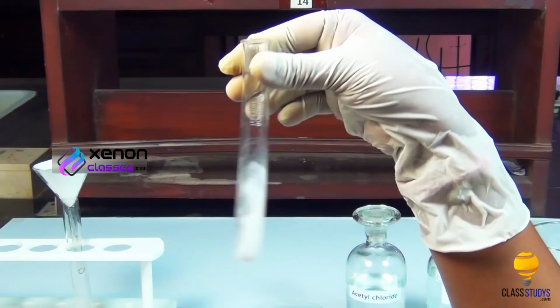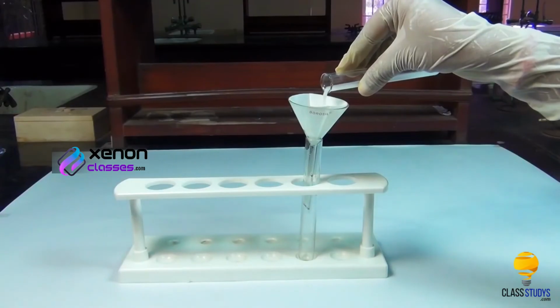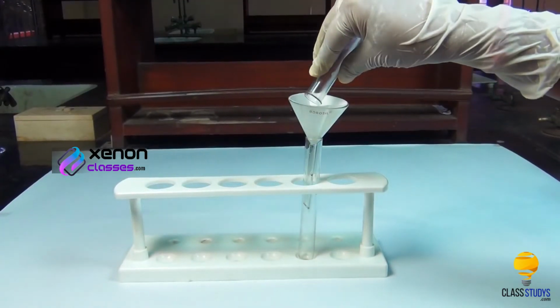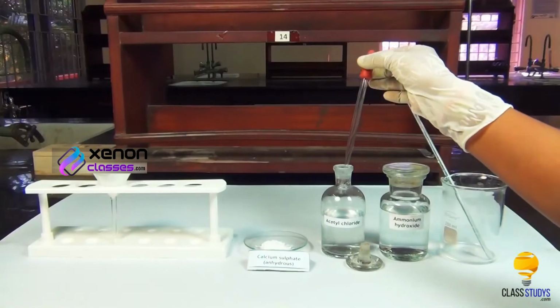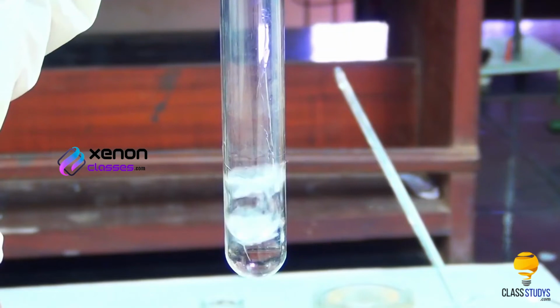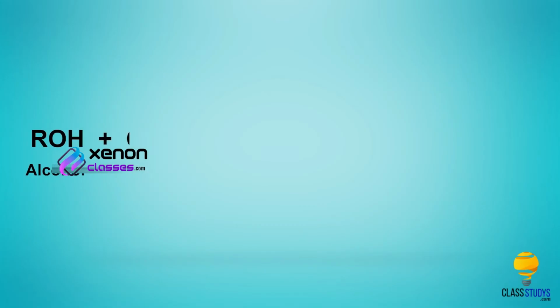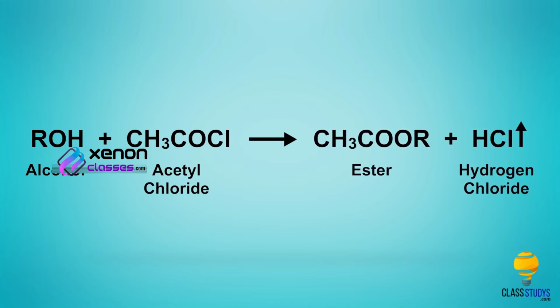Shake the test tube well to remove any water content in the organic compound. Filter the contents into another clean, dry test tube. Using a dropper, add a small quantity of acetyl chloride into the compound. Shake the test tube well. Alcohol reacts with acetyl chloride to give hydrogen chloride gas.